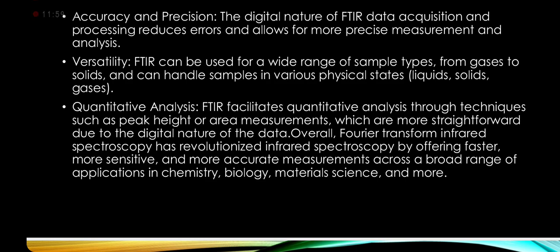Overall, Fourier transform infrared spectroscopy has revolutionized infrared spectroscopy by offering faster, more sensitive and more accurate measurements across a broad range of applications in chemistry, biology, material science and more.